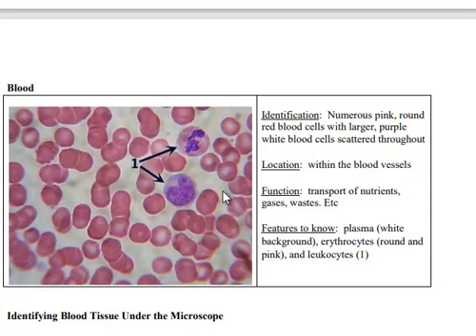And when they're mature, it's almost like they shatter. They come apart, and each of the pieces becomes platelets. So here's a little piece of a platelet right there. Here's a platelet. There's a platelet right there. Those little purplish specks here and there are platelets. And they're involved in allowing your blood to clot.